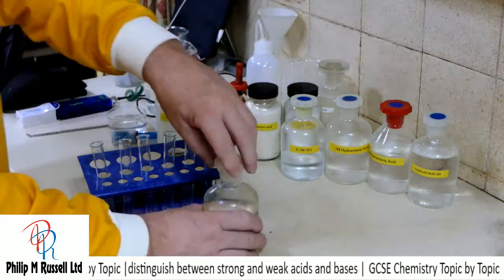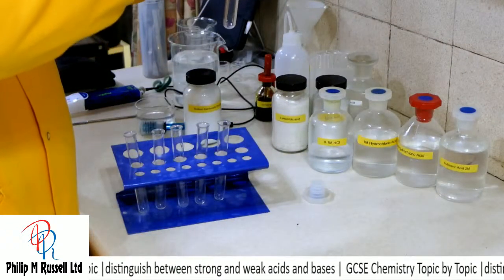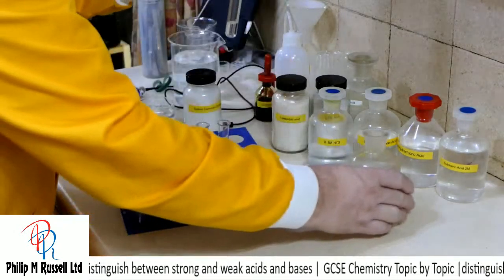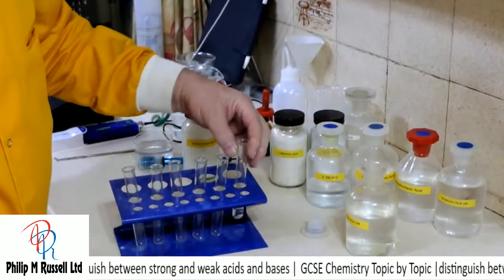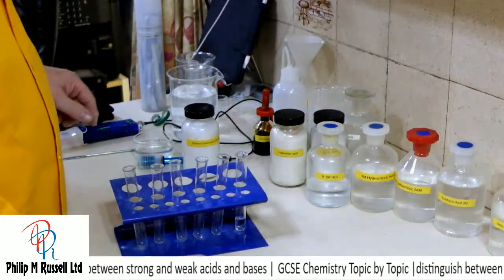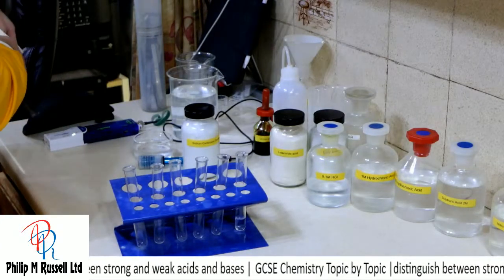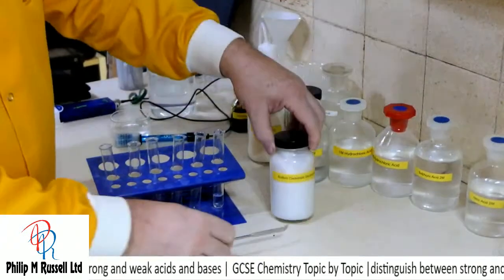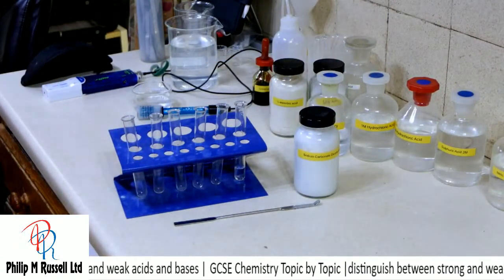And so I'm going to approximately do this, and I'm going to put in a little bit. And when I said a little bit, we're looking at about a finger depth full of nitric acid. We're going to react that with some sodium carbonate. Now, what reaction should we expect?